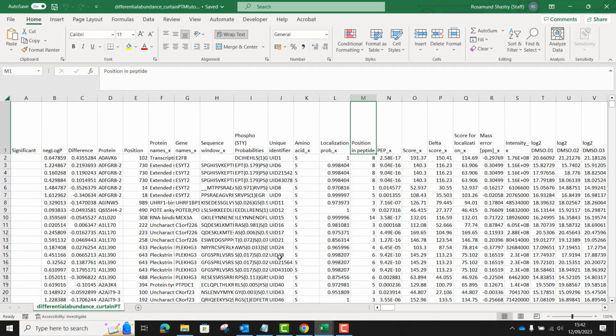So this is a modified search output from maxquantptm, which is the software that curtainptm is optimized to use outputs from. It is possible to process outputs from MS Fragger using a custom-made script we have developed, details of which can be found in the Curtain publication. So some post-processing of the file has been performed in Perseus, the assignment of unique identifiers for each differentially modified peptide, for example, and the differential analysis.